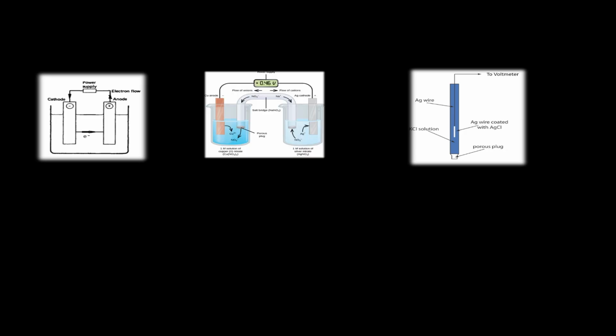Common reference electrodes are the calomel electrode or the silver chloride electrode. The basis for which these electrodes function is what is referred to as a salt bridge. A single cell can be divided into two sections, each of which is referred to as a half cell, as shown. An electrolytic junction is placed between them. Using a salt bridge prevents a gaseous or chemical product that may be generated at one electrode from migrating to the other electrode and somewhat reacting prematurely.